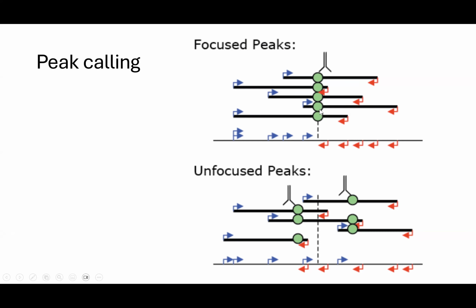So maybe the actual thing you cared about was in the middle. But if they're only slightly different, or even if just the settings for the peak calling are different, a similar pattern could come from two nearby proteins. Even though these are only slightly shifted, you would get two different peaks.